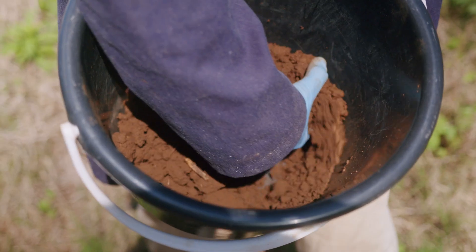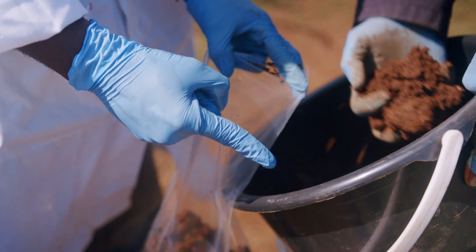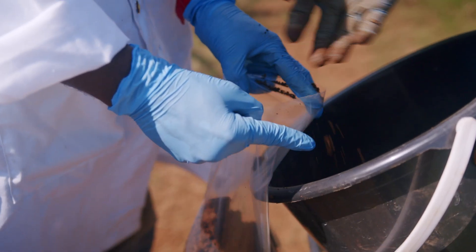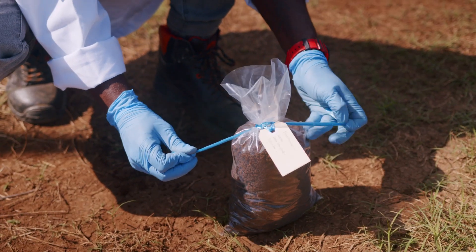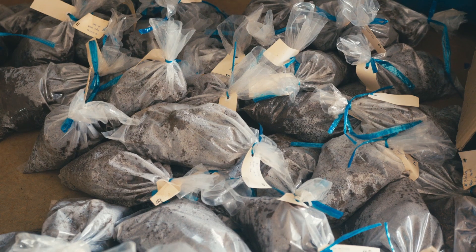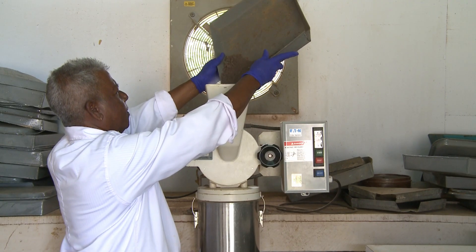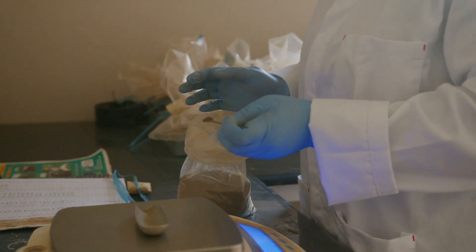After sampling, the soil is properly labelled — we record the sector, the farm number, the date it was collected, and who the collector was. The sample is then brought to the analytical lab where it is dried for one or two days, then ground, and depending on the analysis required, we weigh it separately.